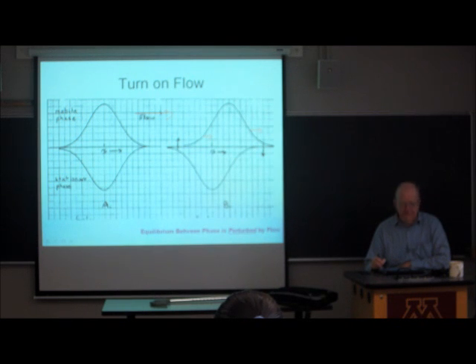But as soon as the front of the peak gets downstream a little bit, the molecules in the mobile phase are going to see that there are no molecules in the stationary phase where at equilibrium there ought to be. So these guys up here in the mobile phase are going to move by diffusion down into the stationary phase and attempt to reach equilibrium.